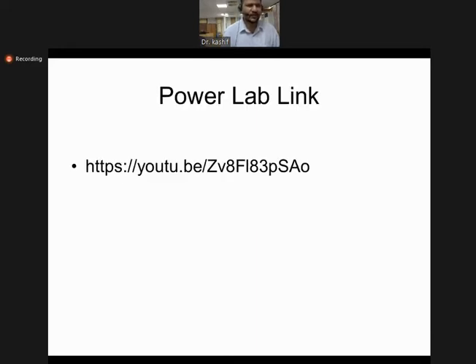I will just give you a link to this PowerLab. You can watch the video on that, because at this moment I cannot show the video since it takes time, and we are also running short of time and have this net problem. So I just added this link. You can see the PowerLab instrument.